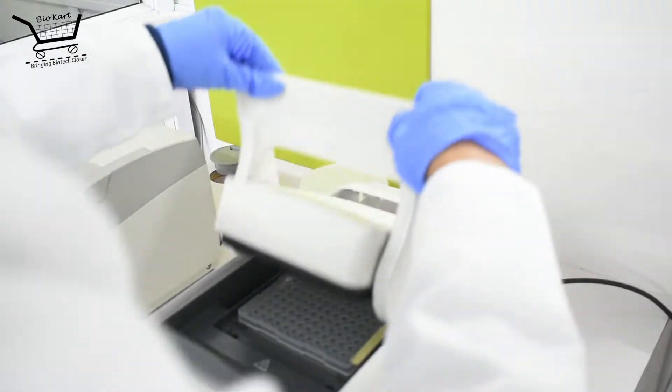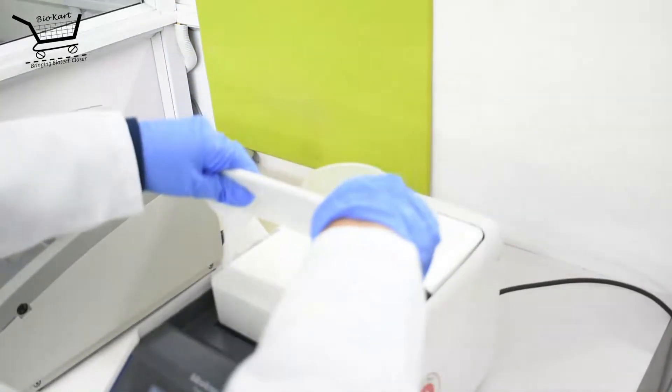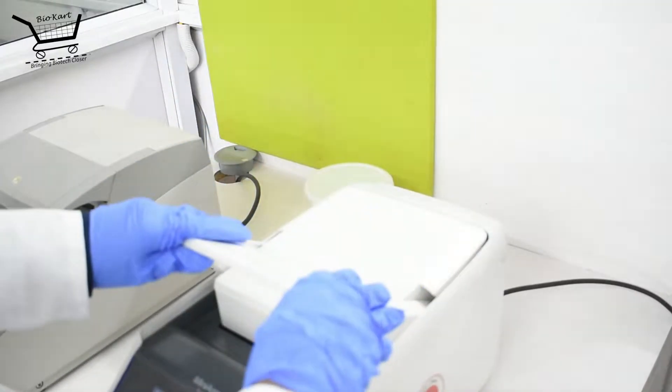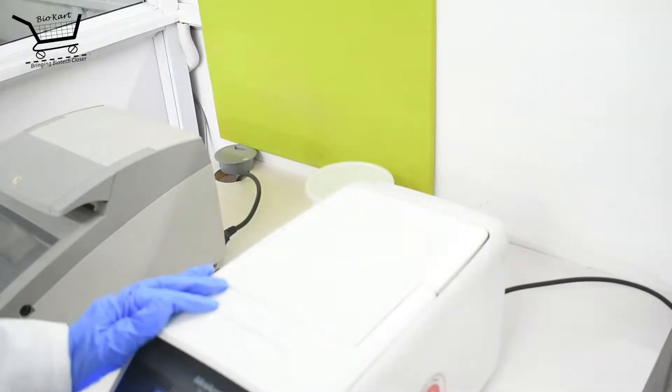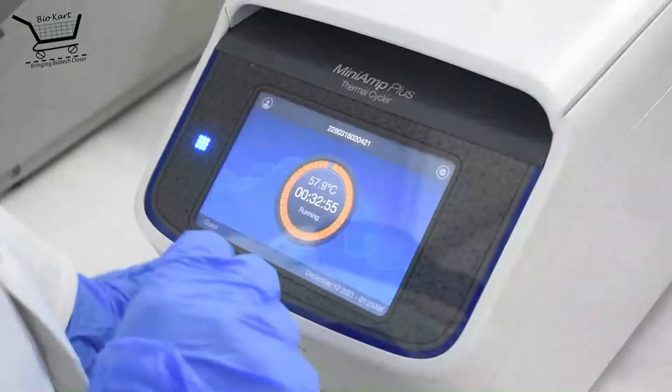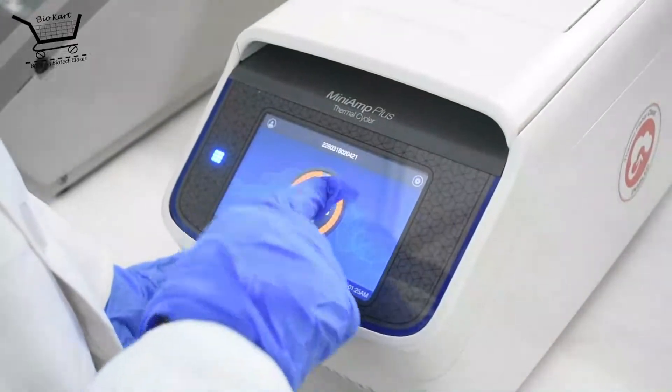The generalized workflow for the initial step in library preparation is as follows. DNA, primers, and nuclease-free water are added in equivalent amount to 2X high fidelity hot start master mix. Amplification is performed in a thermal cycler.